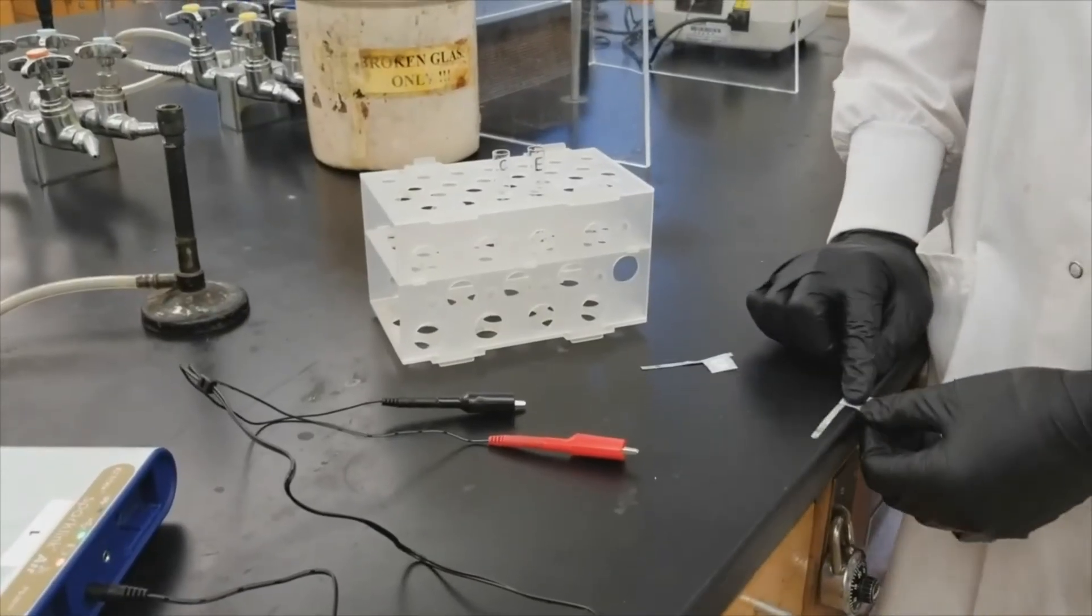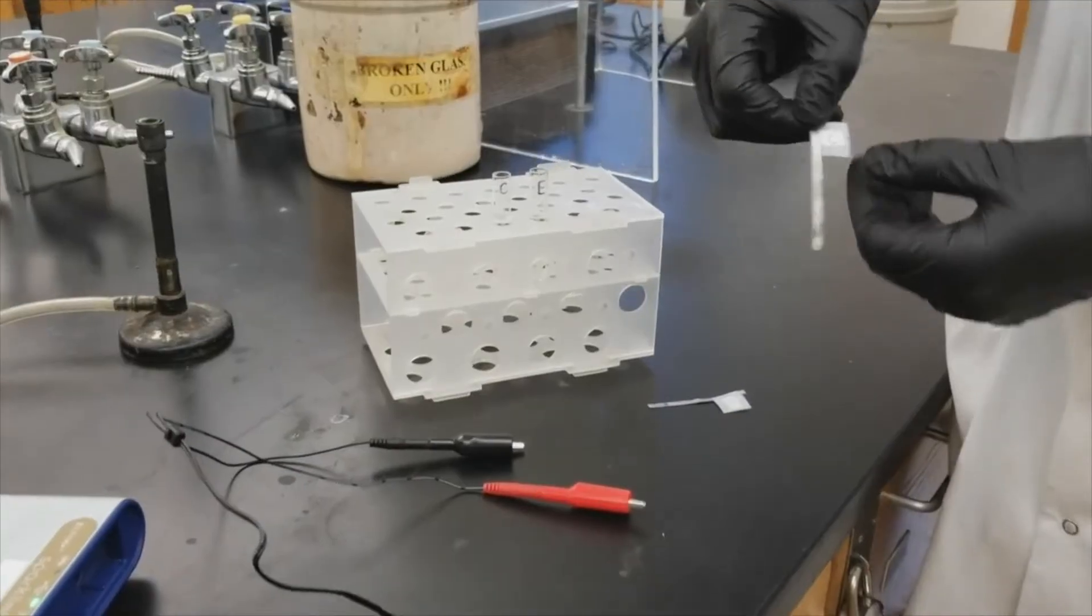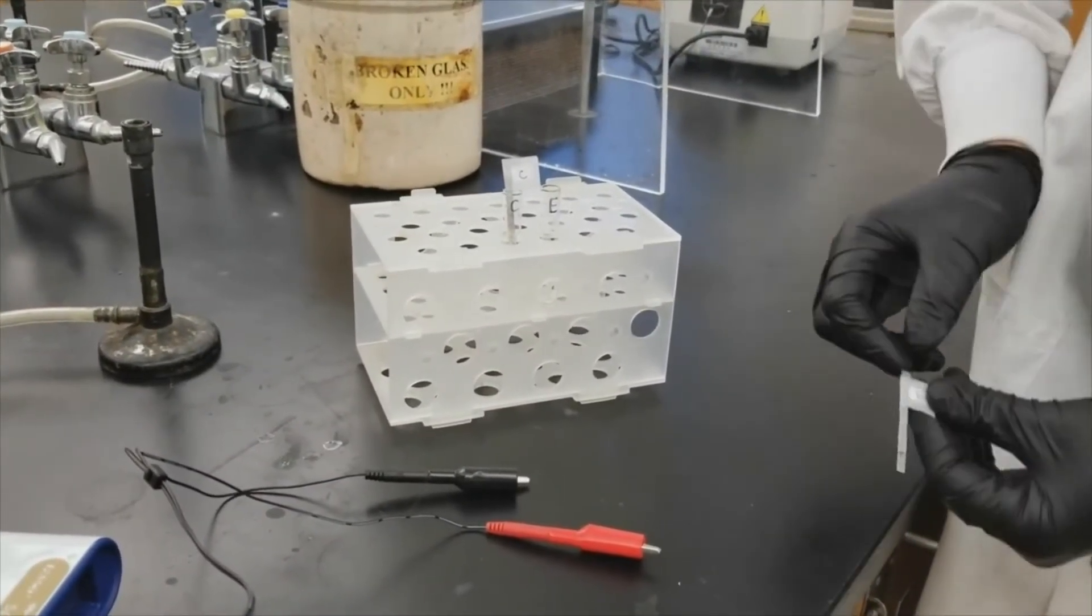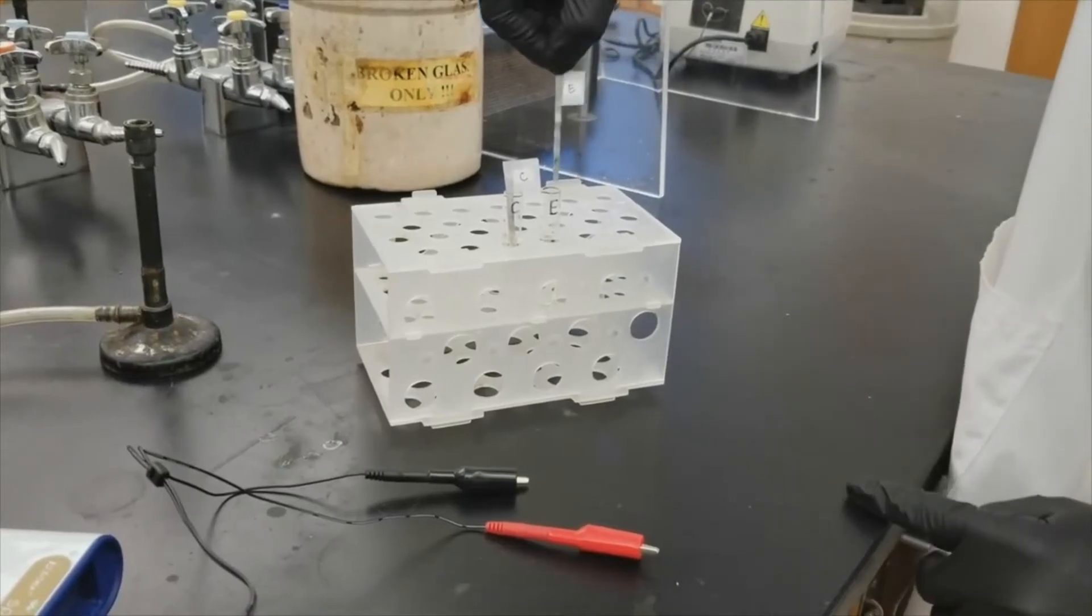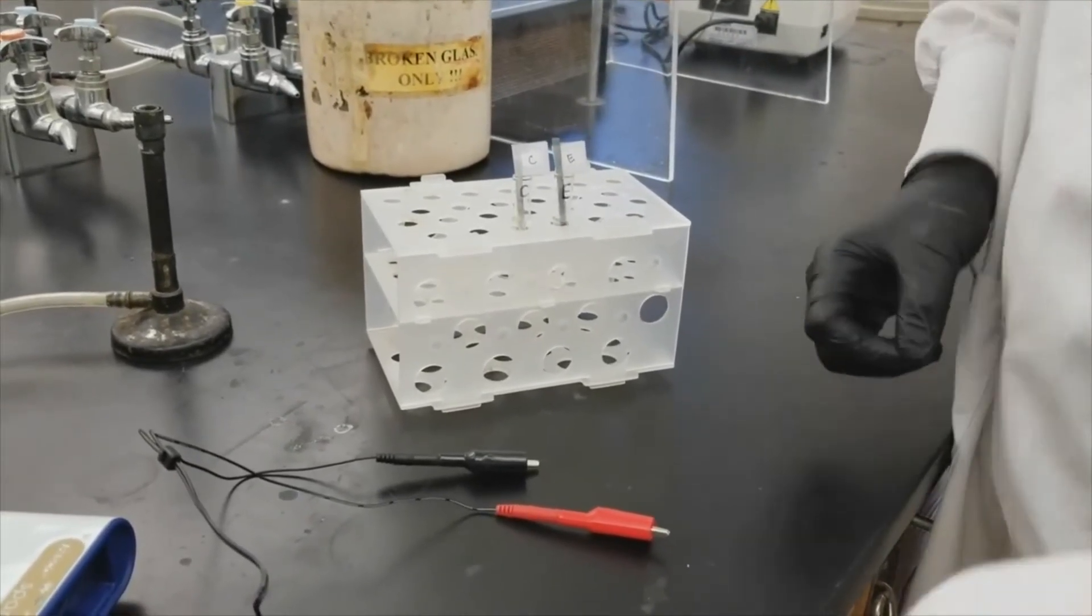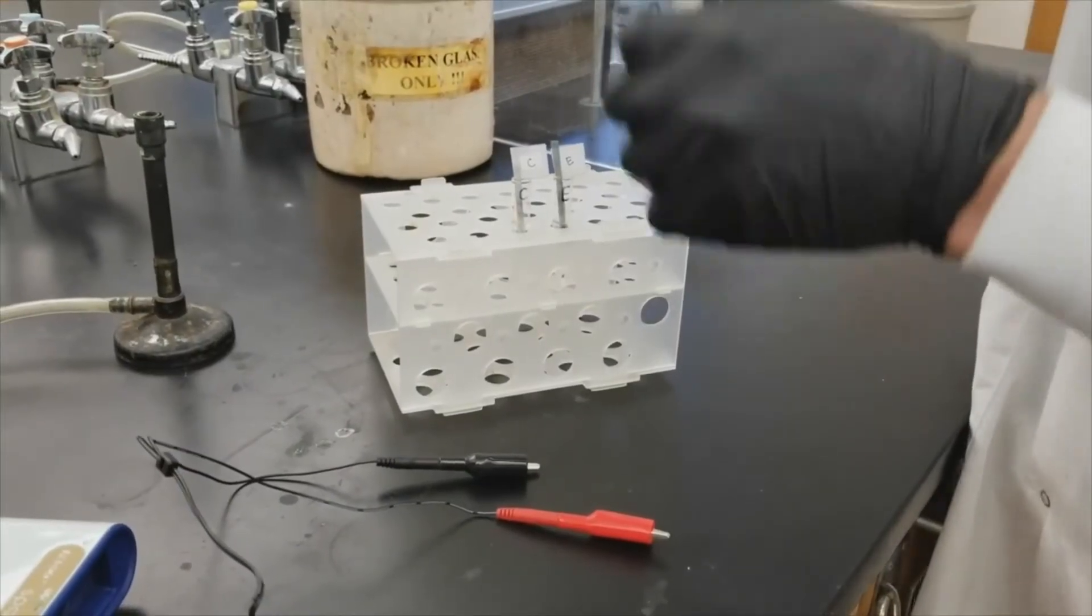Next, you'll need to gather test tubes of your five unknown metal ion solutions and place the corresponding metal electrodes into each solution. You only need to fill the test tube about halfway with the ion solutions, but make sure it's enough that your metal electrode is submerged.